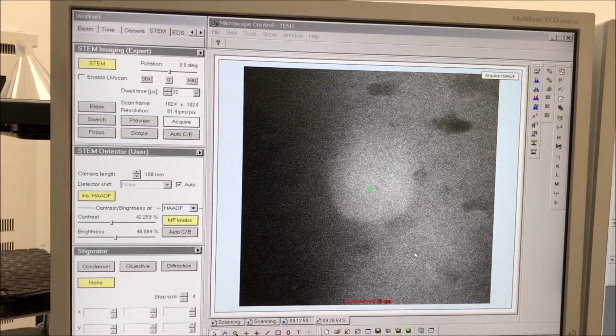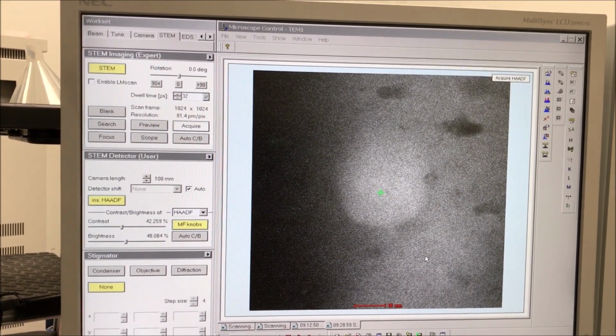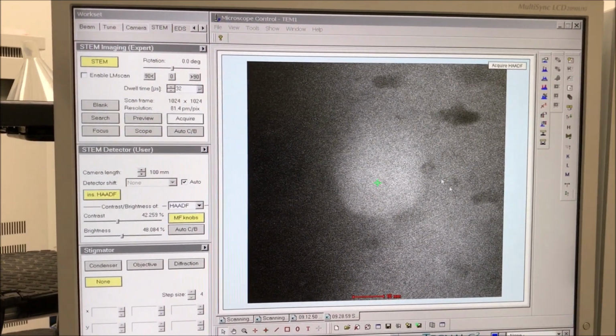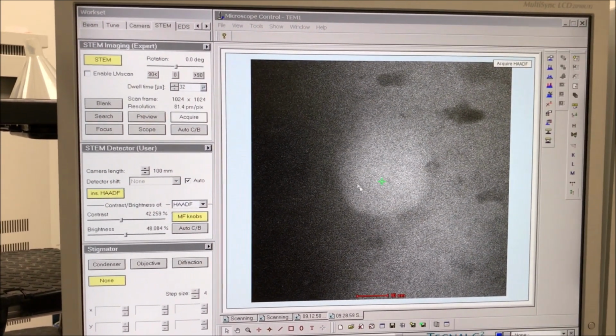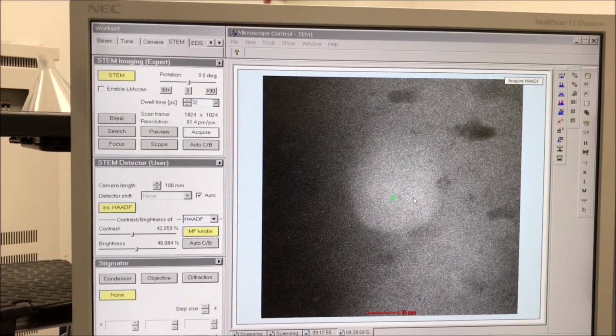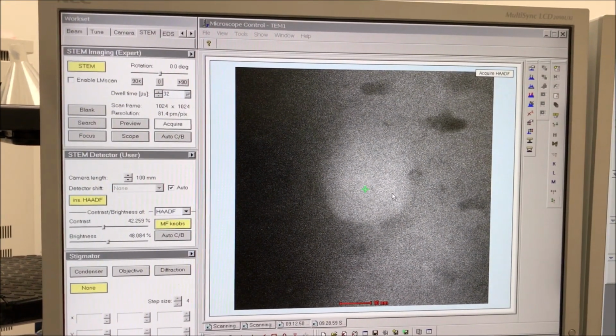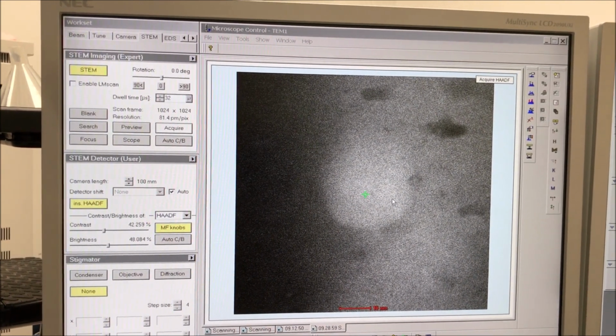It causes a polymerization of the precursor molecules into a solid chunk of polymer, which is what you see here. Okay, and ultimately gives us our decreased image quality.